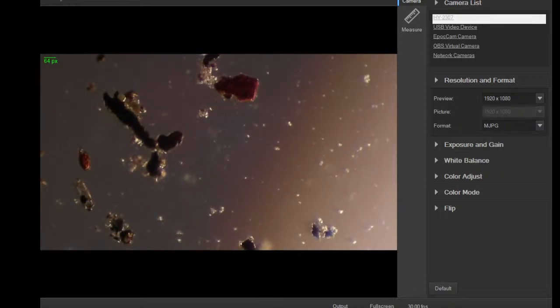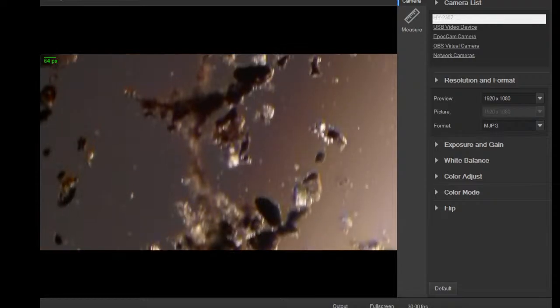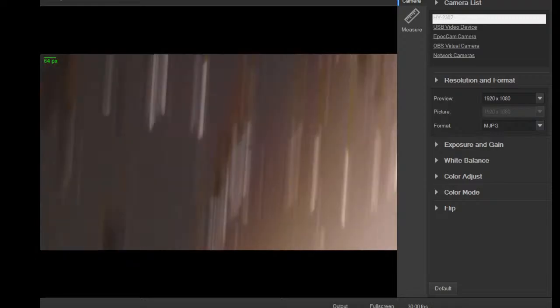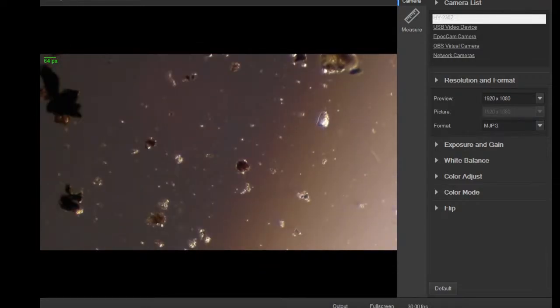Again, lots of different weird, colorful bits of stuff. Could be man-made fragments of stuff. Sometimes you find colorful fibers in here that are just man-made fibers. Which is, you know, after looking at this for a while, you realize how forensics is so easy to catch people with unique fibers, because the damn fibers just shed everywhere. So would-be criminals should be careful.